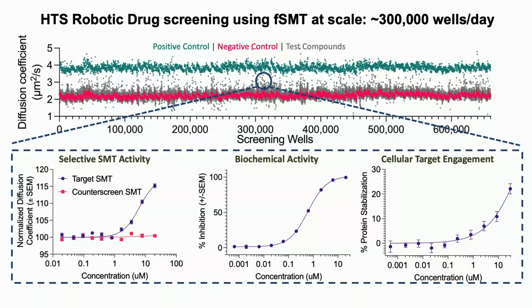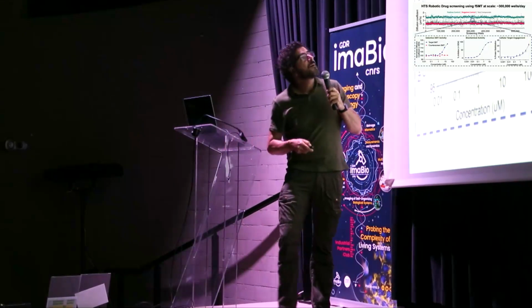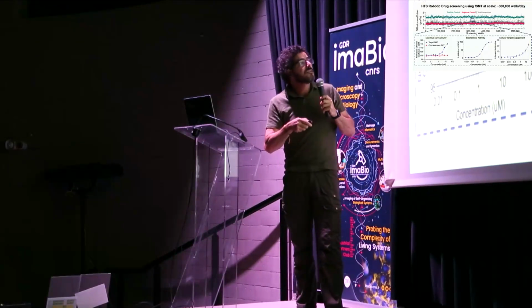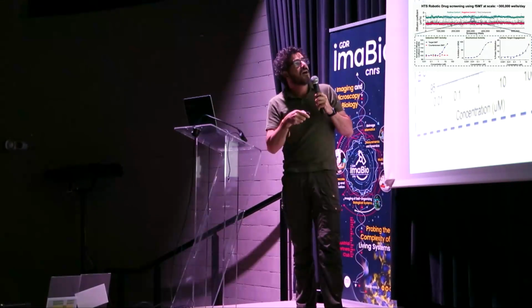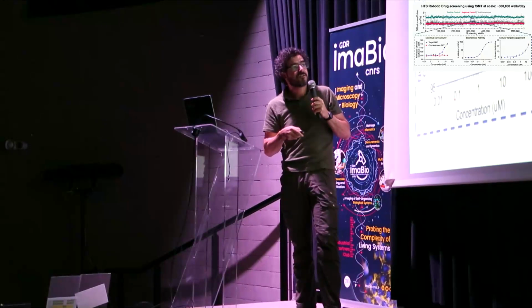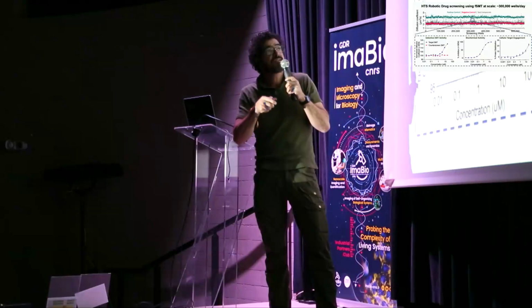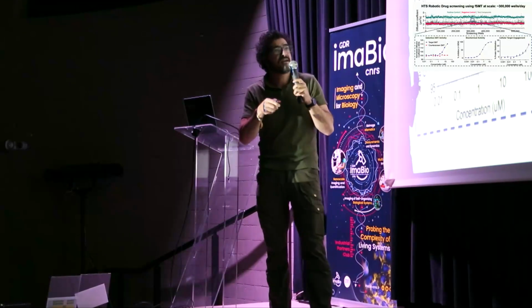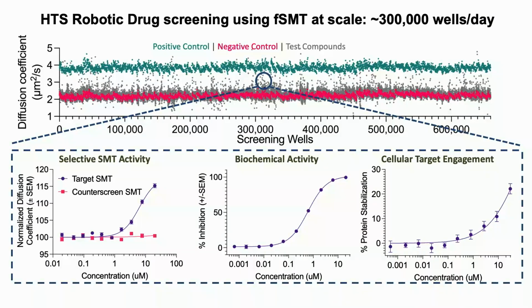300,000 wells a day, a petabyte of data generated every day. You can imagine the problems to analyze, and of course, we gave up on storage. Interestingly, you can see how these molecules are going to change the dynamics of our protein of interest as a function of the concentration, which is going to be really important. And then we can compare it to some biochemical activity of cellular target engagement with these factors.